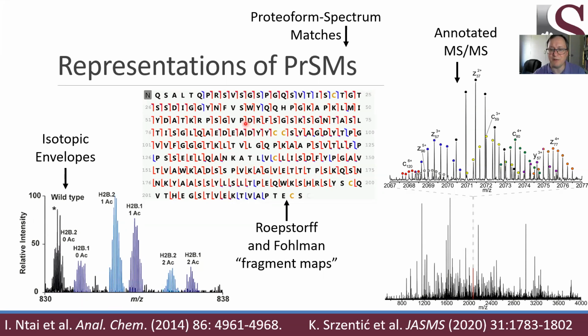You can see that for some of these ions, we have only evidence from the N-terminus. All of these that have a flag pointing off to the left but not to the right are cases where we have the N-terminal ion only. Ions down here that contain just a flag pointing to the right at the bottom, those contain only the C-terminus. And relatively few of the peptide bonds have evidence from both the N-terminal and C-terminal side. We do for this little AG bond. Up here we have a pretty good run of fragment information that shows that all of these had both termini represented for each of these peptide bonds.